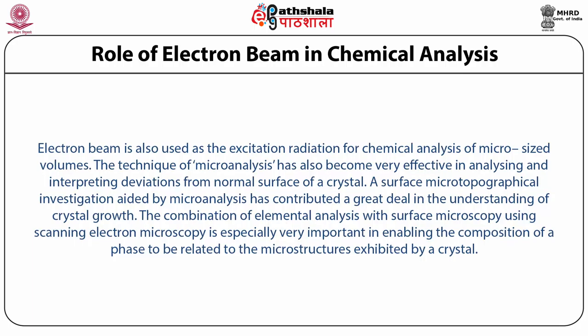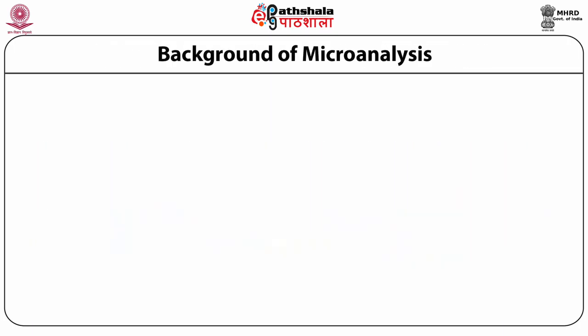The combination of elemental analysis with surface microscopy using scanning electron microscopy is especially important in enabling the composition of a phase to be related to the microstructures exhibited by a crystal. Now, what is the background of microanalysis?